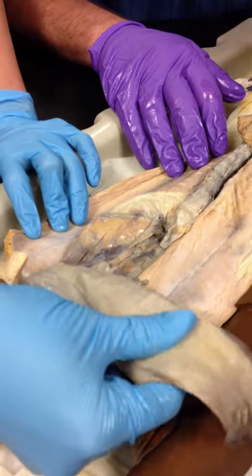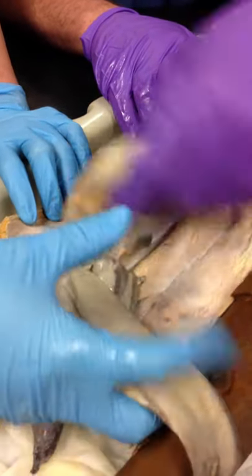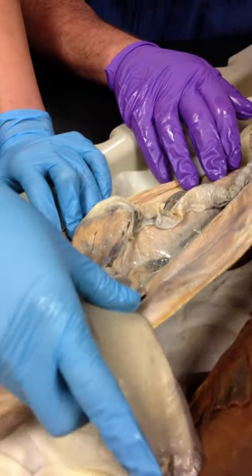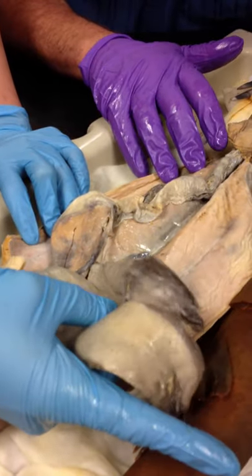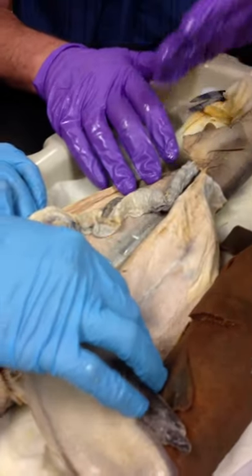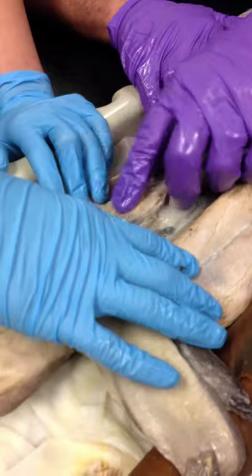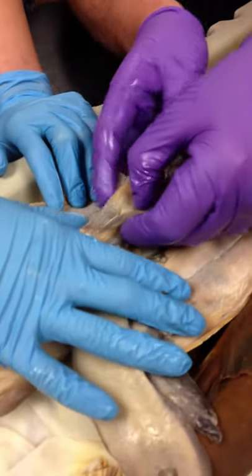You did the dissection. You saw a swim bladder, right? They use the swim bladder to help them float. But if you look in the shark, there's no swim bladder. They use oils. What do you know about the density of oil compared to the density of water? Yeah, it's lighter. Oil comes to the top of your bowl of soup. So this works the same with sharks. The sharks become more buoyant, a little bit less dense than the area around them, by retaining oils. Now, the thing that Colleen is messing with right here, this big structure, is called the stomach. And the stomach is equipped with little wrinkles inside.